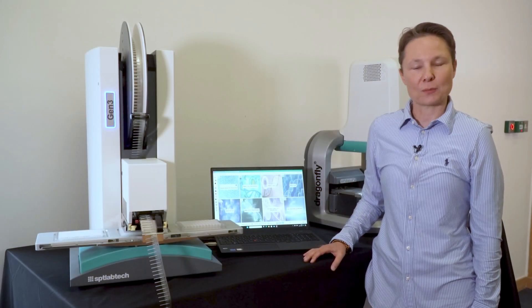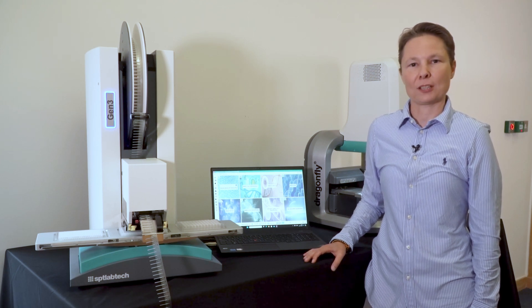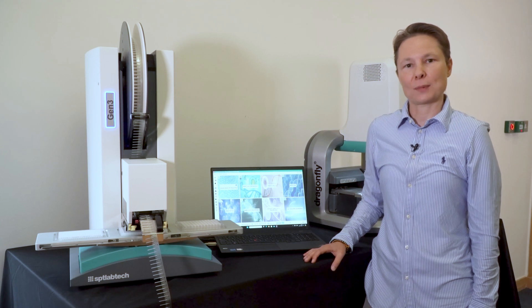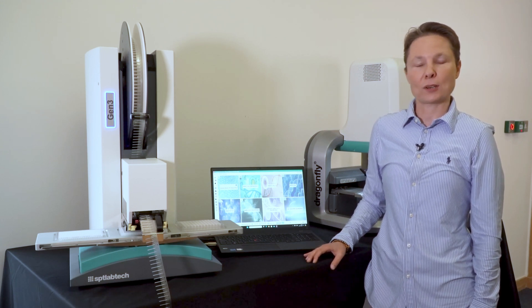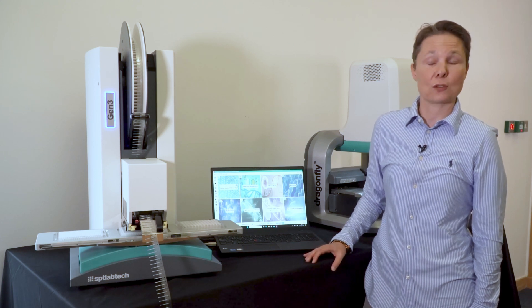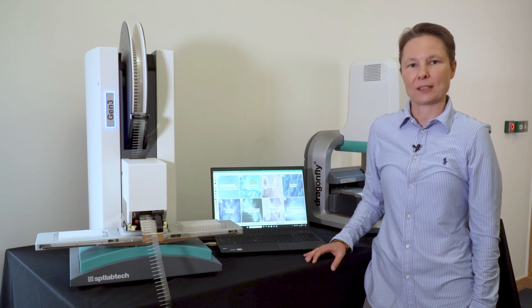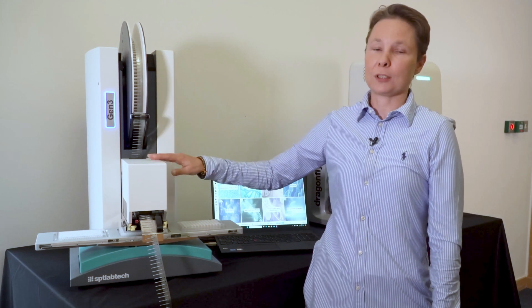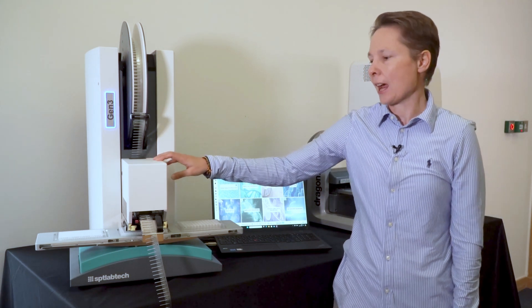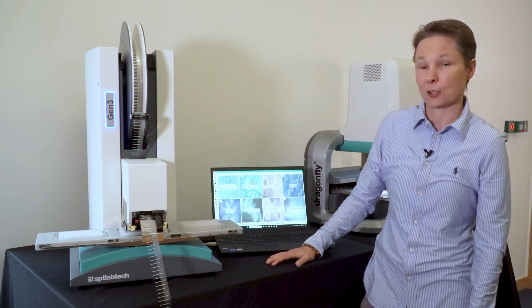Mosquito Gen3 delivers accurate and precise multi-channel pipetting from 500 nL up to 5 µL. Unlike traditional air displacement systems, the Mosquito True Positive Displacement Technology maintains volumetric accuracy across a wide range of reagent viscosities and laboratory conditions without the need to tweak liquid settings. The tips come in the form of a spool with individual pipets loaded into the head. They are automatically changed and moved into the waste bin once used, to minimize the risk of contamination of your samples, reactions, and work area.